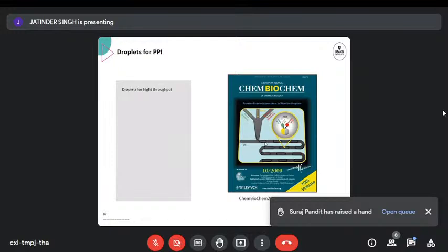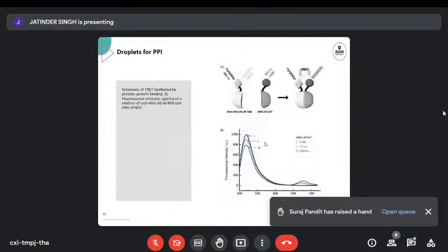So we get crystallization for probably two or three rows of droplets. And further down, the conditions are not right for crystallization again, so we don't get crystallization. That gives us a very good indication where the optimum for crystallization would be. You can repeat the experiments with the conditions that you'd like to have, and more subtly fine-tune it. Which is a lot faster way to optimize protein crystallization than any other ways around.